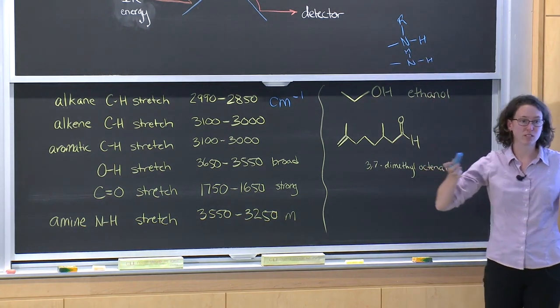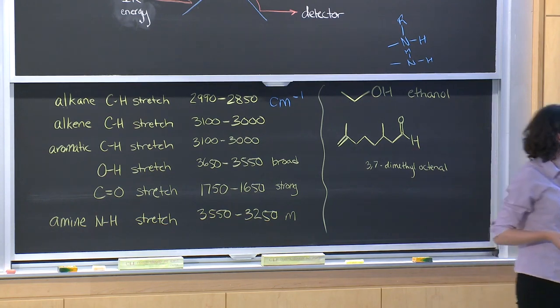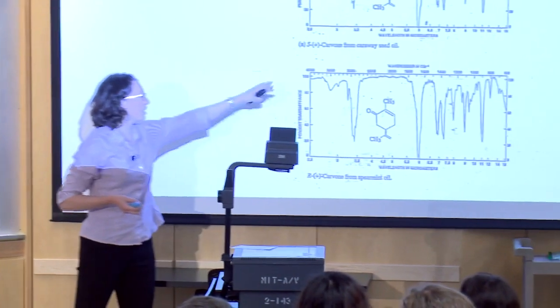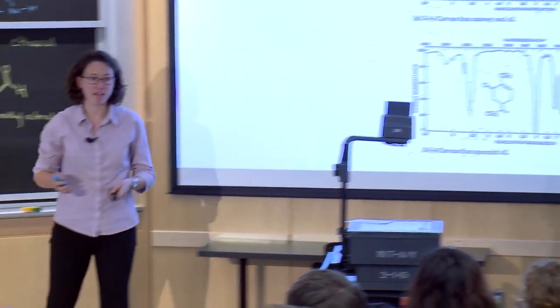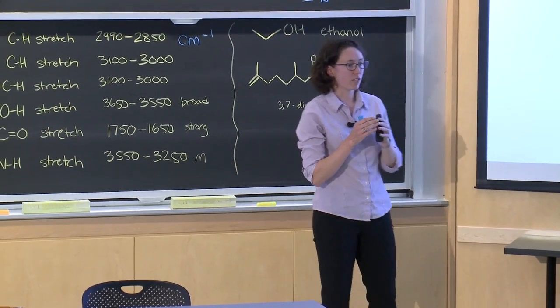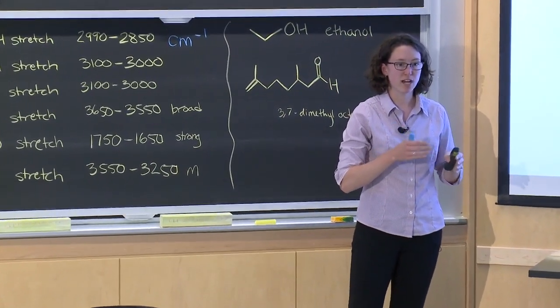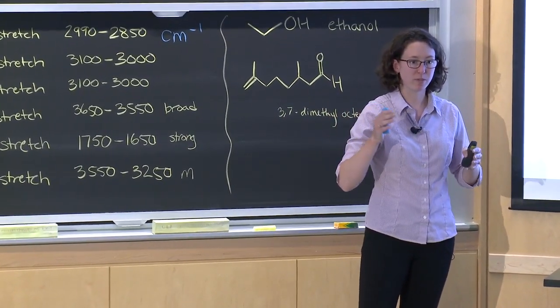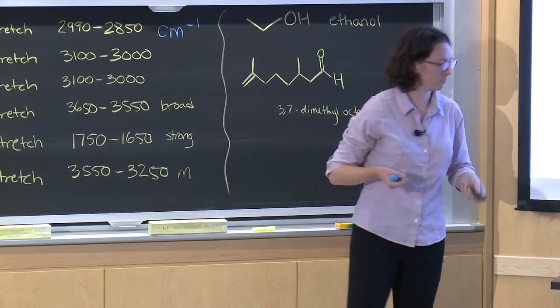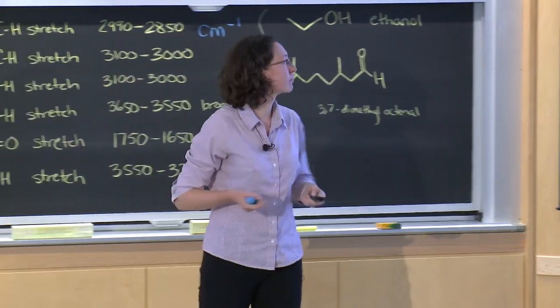So that's when you can quantify atoms through this. But no, the intensity does not always correspond to how many of the bond there are, since the intensity is mostly a function of how much the dipole moment changes. So you could have a lot of CH bonds, but you won't see a very intense peak.